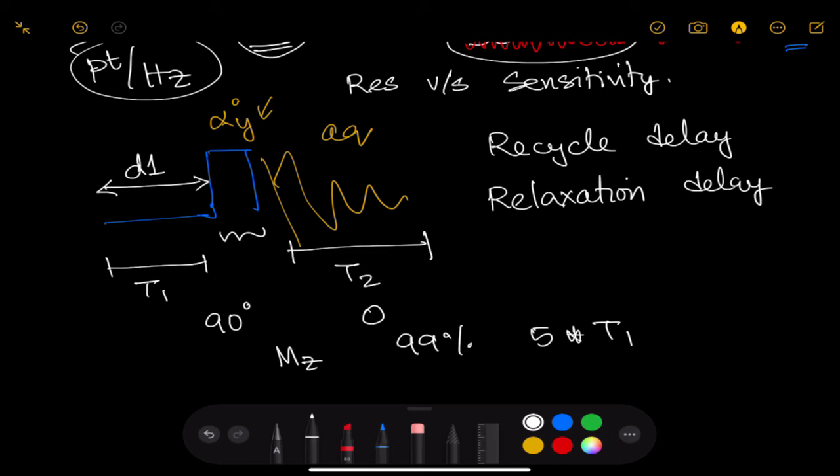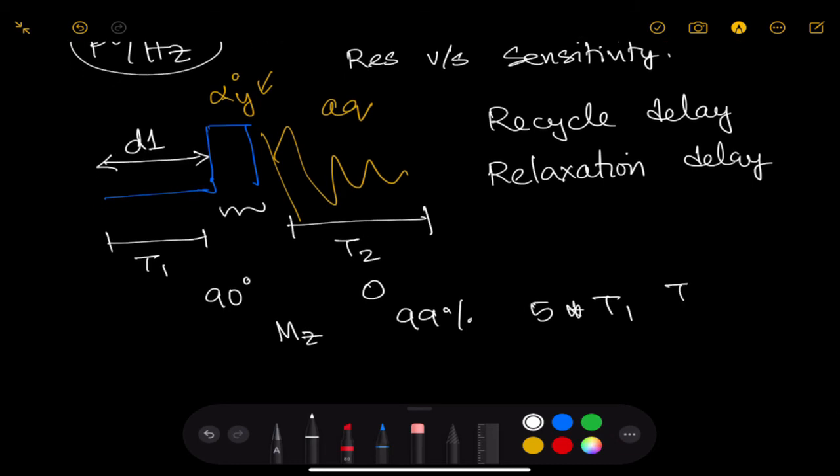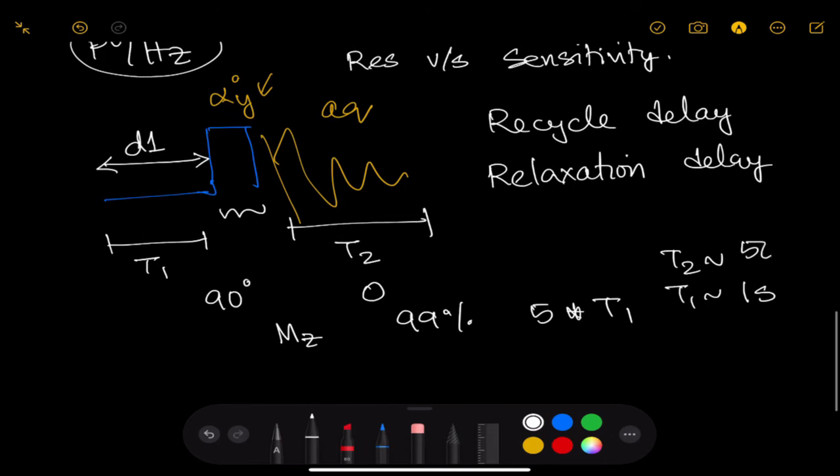From here, you can understand that T1 times are characteristically longer; for this example, we can take this to be 1 second. We assumed a T2 time of 500 milliseconds and T1 of 1 second. The total acquisition time you would set to 1.5 seconds. On the other hand, the D1 time is going to be set to something like 5 seconds.